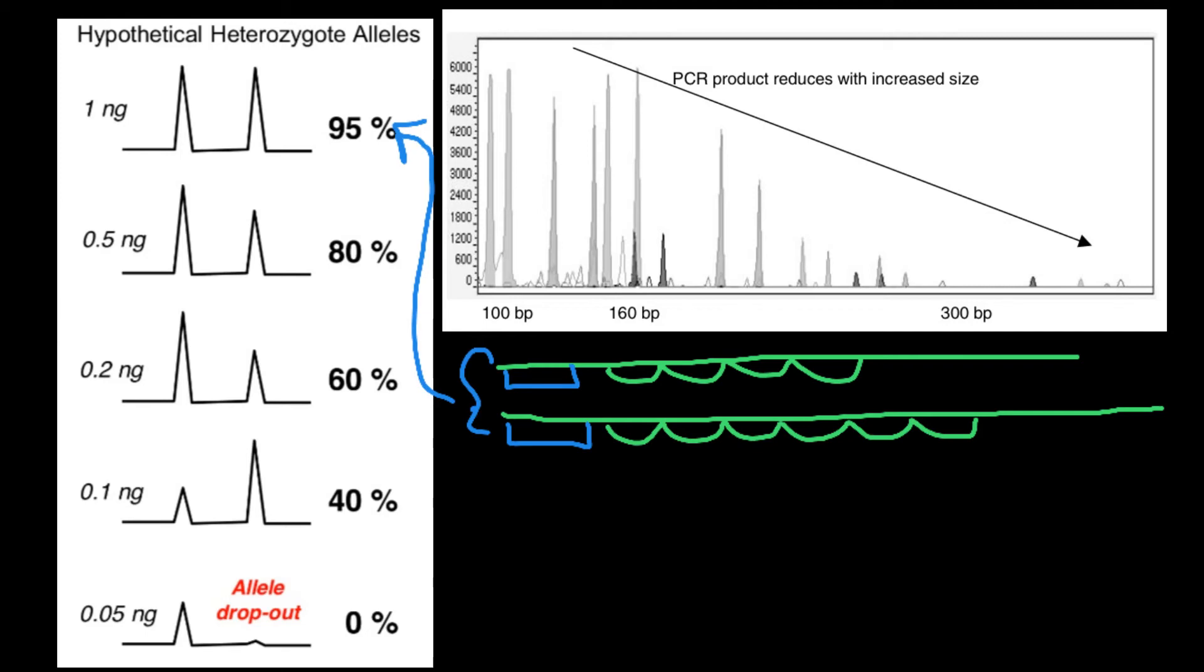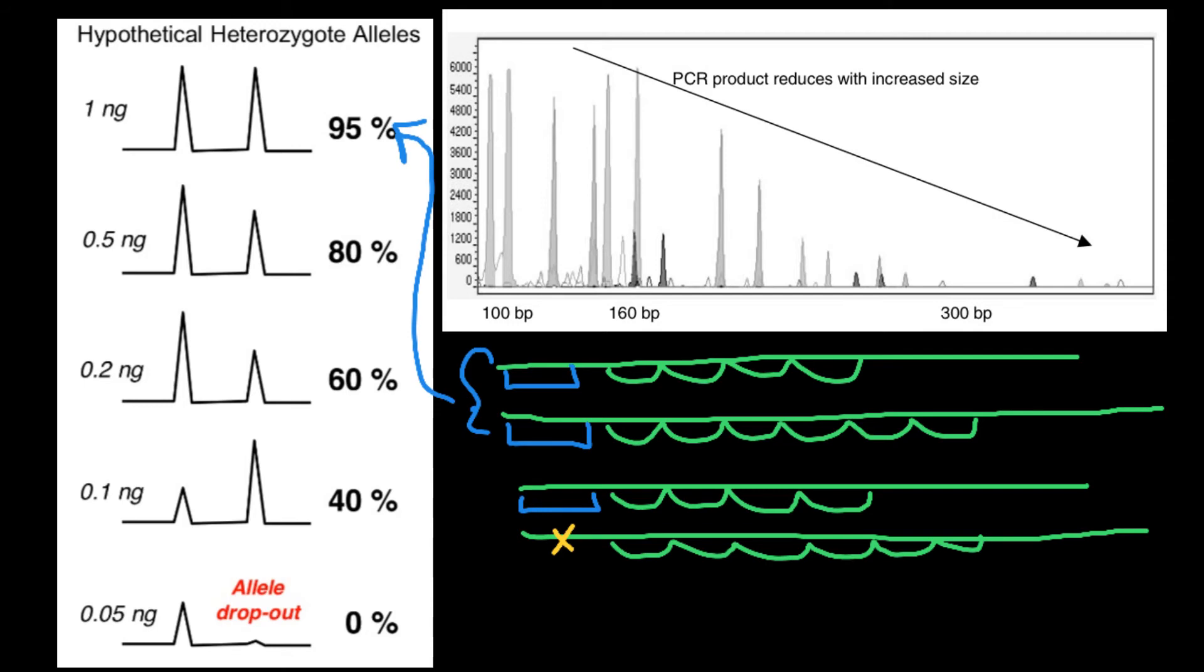Let's take now another case where, once again, we have a locus that is going to be heterozygous. One, two, three, four repeats for one allele. And one, two, three, four, five and six repeats for another allele. But now let's imagine that here, at the site where the primer would attach, we would have a point mutation. So what does it mean? It means that this primer would anneal and would make a good quantity of copies of this type of molecule, this type of allele.